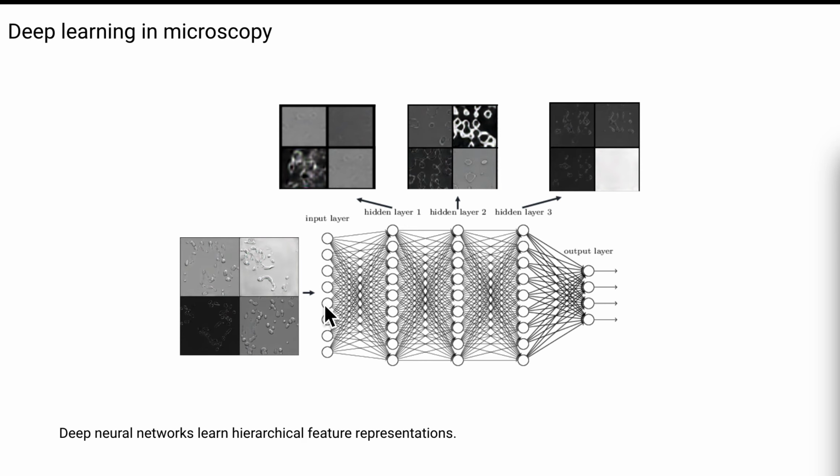Suffice it to say here that we have this kind of strange network structure, and we feed our images one by one into it, and they percolate down through the network. At the bottom, we predict where and what type of cell we see. That information of successes and failures to predict correctly is backpropagated through this network and updated. We repeat this process of passing examples with known answers over and over again, in what are termed epochs, until we hope it converges on a good classifier with nice performance.